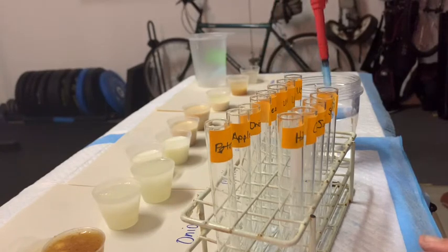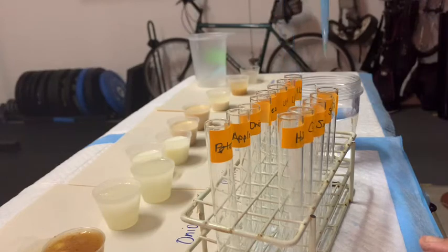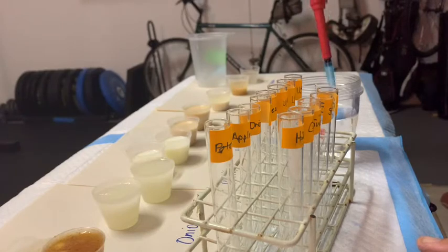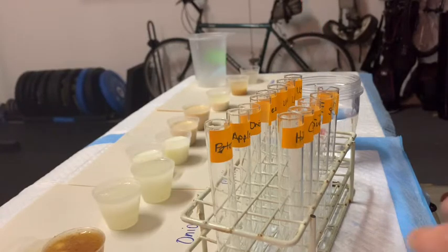You could also do this using a serological pipette and a pipette aid. Let me first do the first five or six test tubes where I'm going to put my controls — I'll do that using a pipette, and then I'll come back and show you how you can do that using a pipette aid.